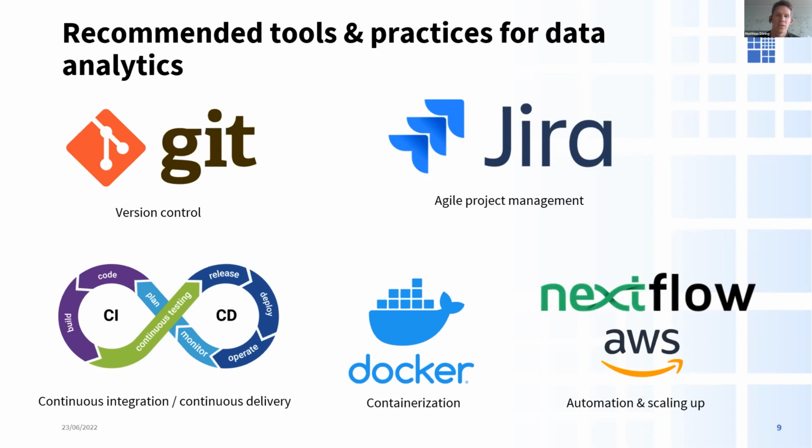Finally, to really scale things up, you should definitely keep workflow management systems on your radar, such as Nextflow, to connect different steps in a pipeline of analysis steps, and then also consider putting that on cloud systems such as AWS to really scale up to big data.